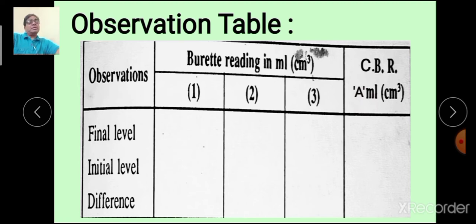Thus, there are two varieties of titration. The first one we saw was the back titration, that is the titration of the reaction mixture with acid, while the second one was a titration of a plain alkali with acid.